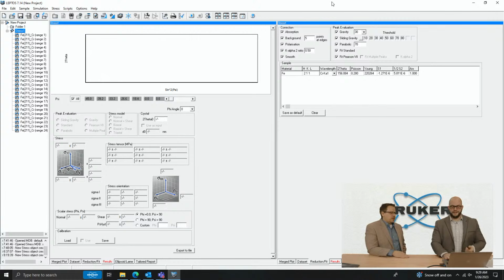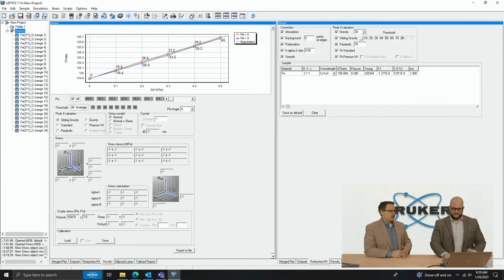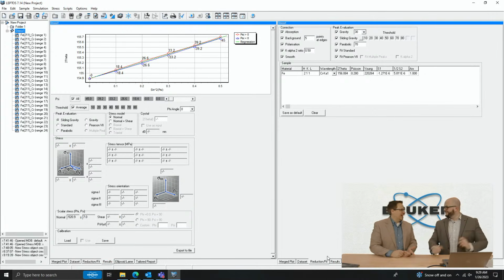So I'm going to hit play and select all of these, so it's going to do them all, and we'll see what happens. While you click that, maybe we can talk. Oh, it's done. Well, I guess we'll have to talk about that later. How do you like that?